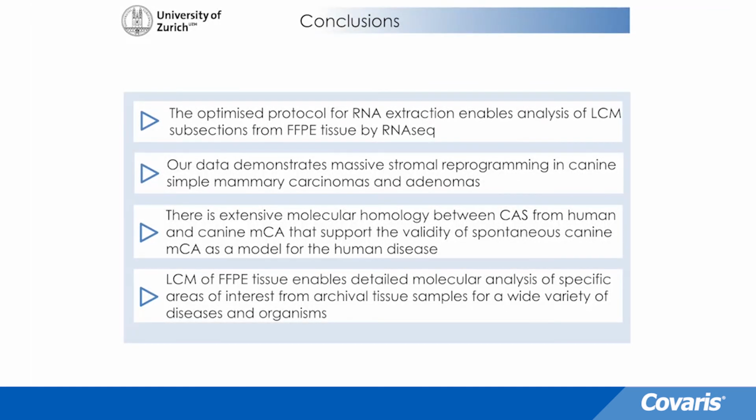So let me come to the end and quickly reiterate some of the important points we touched upon today. I hope I could convince you that the Covaris-based protocol for RNA extraction enables analysis of laser capture microdissected subsections of formalin-fixed paraffin-embedded tissue by RNA-Seq.